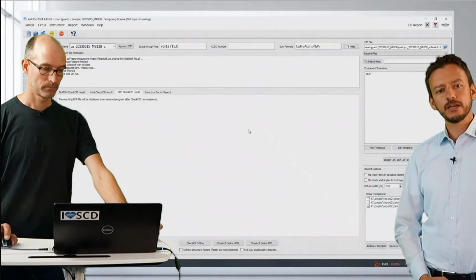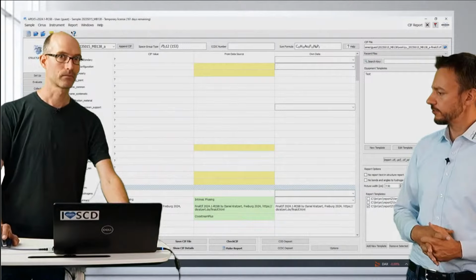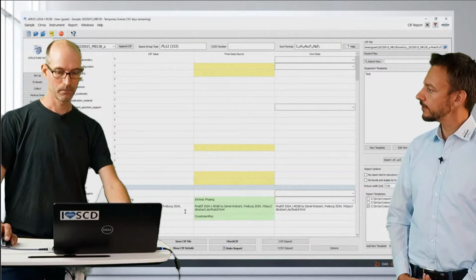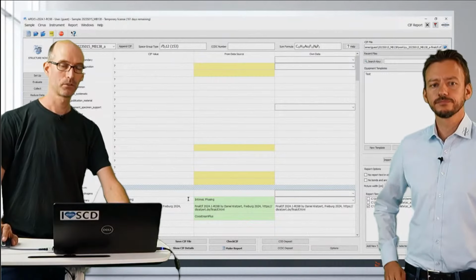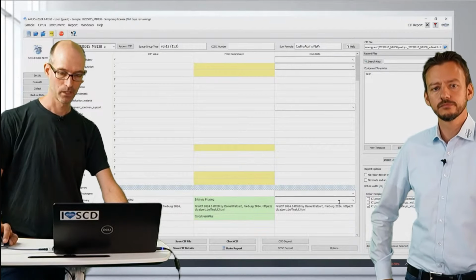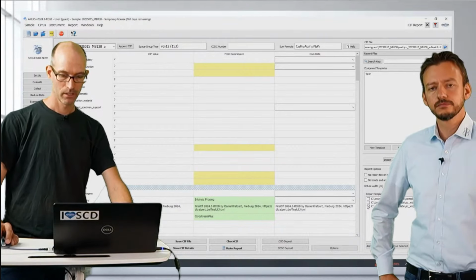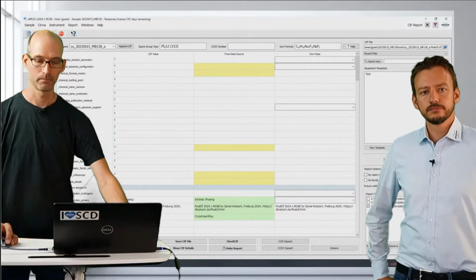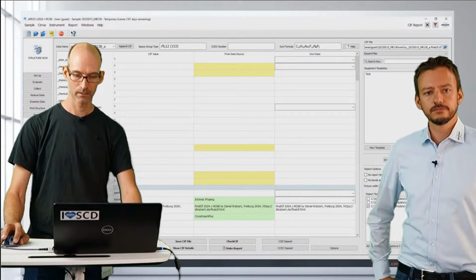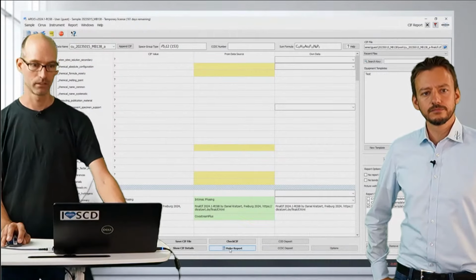Okay, thanks, Daniel. Quite often it's also important to create a little report on the sample I collected. Is it also possible to automatically create a report similar to the previous report plugin we had in Apex? Of course, you have two possibilities: either create an HTML report or create a docx, MS Word document. And from that you could also do PDF files. So let's start with the HTML report. We have three predefined templates. You could of course create your own templates, but let's use the HTML report and click on Make Report here in the middle.